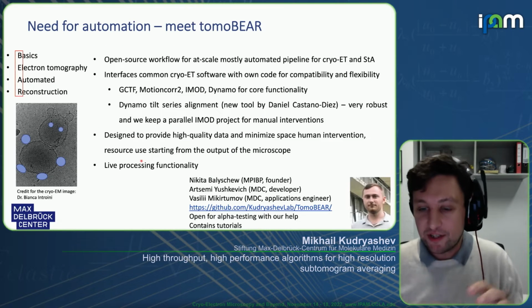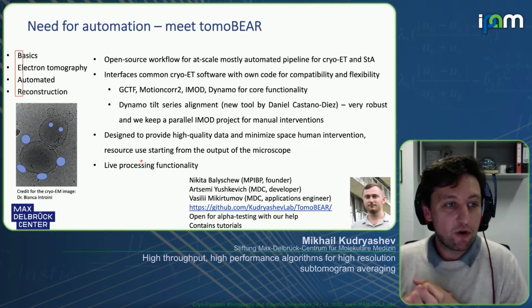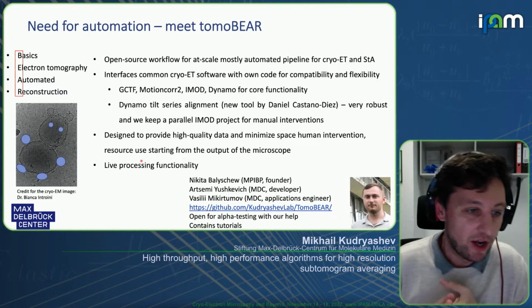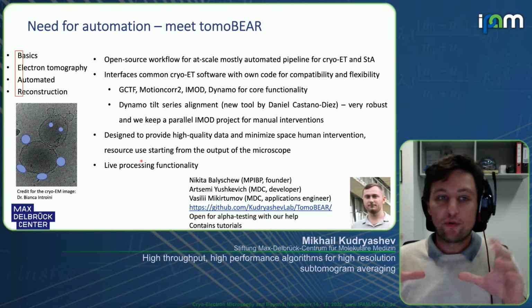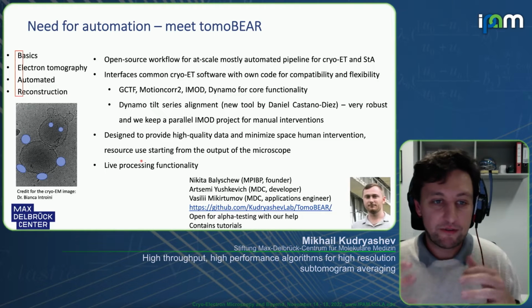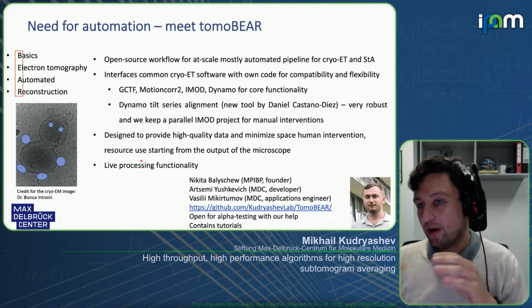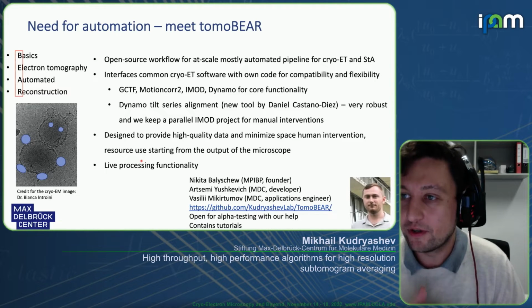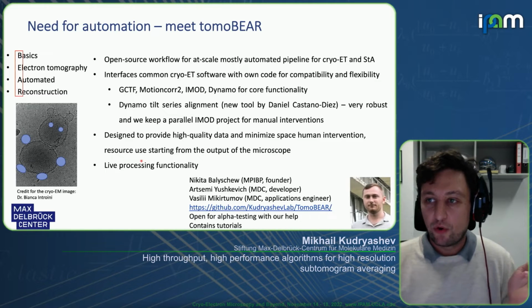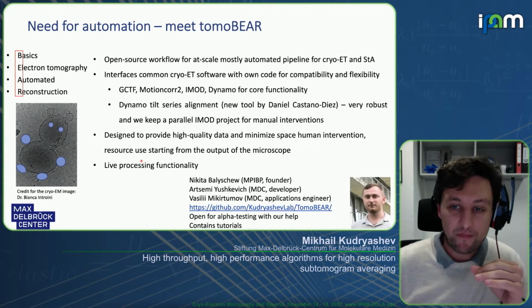So we, Nikita, in my group at the Max Planck in Frankfurt, developed what we now call TomoBEAR. It's the Basics of Electron Tomography and Automated Reconstruction. It's all open source and it's written in MATLAB, and it calls different commonly used cryo-electron tomography software with a lot of layers of code between it for compatibility and flexibility. And so we managed to do a lot of good default presets.